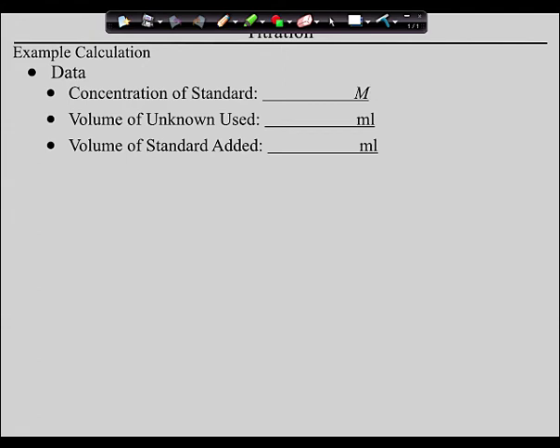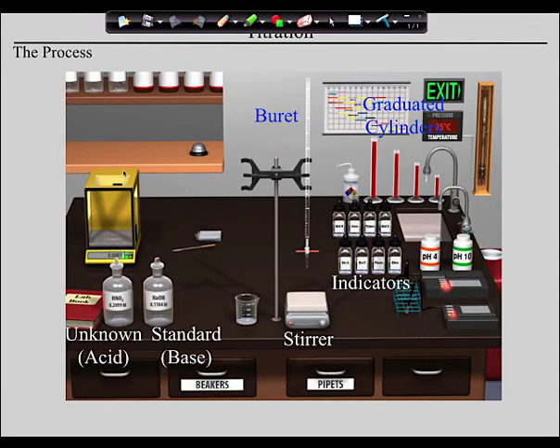So guys, again, those are all of the things that you need. Those are the players, if you will, in titration. Now, guys, check this out. Let me turn out the lights so you can see it. Guys, this is a screen capture from the software we're going to use. They got this right all the way down to the orange valve on the burette.